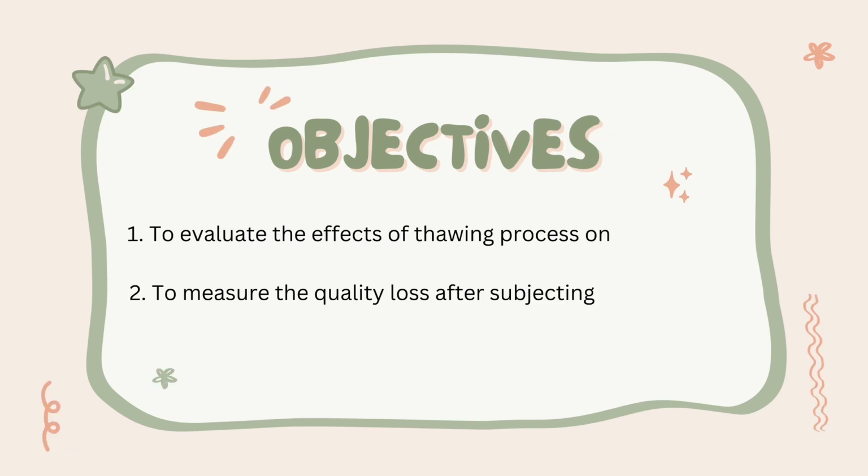Next, the objective of this case study is to evaluate the effects of the thawing process on frozen beef and to measure the quality loss after subjecting it to different thawing methods.